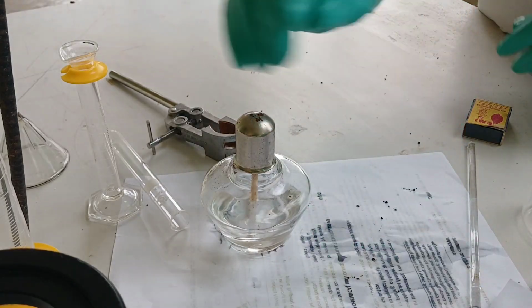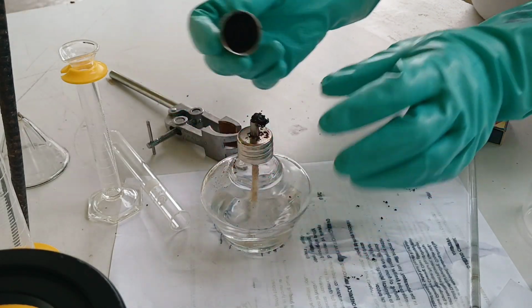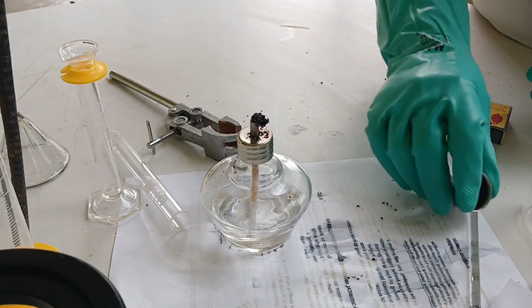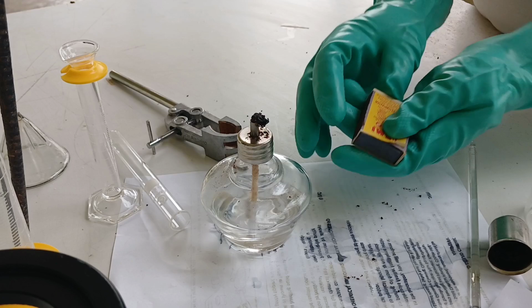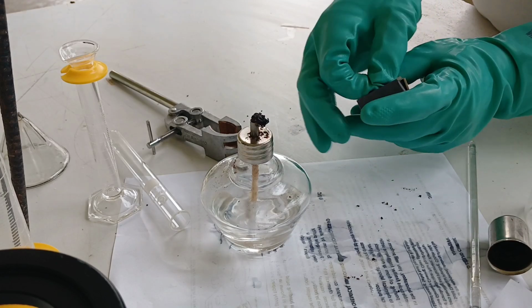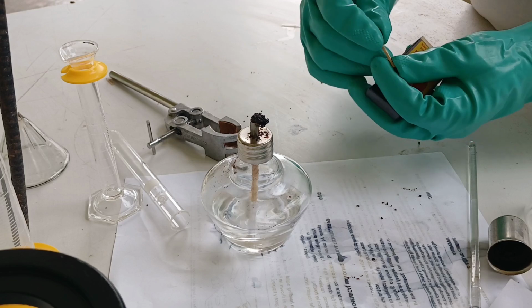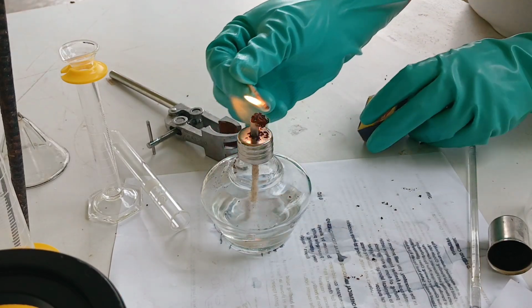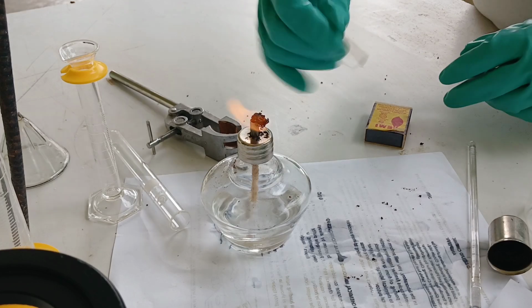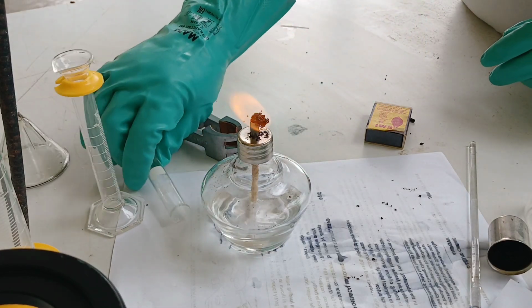By this time, yes, you are correct. You will be using that alcohol lamp again because we will be doing what particular technique? Yes, the safe heating technique for liquid in a test tube. So we're trying to heat liquids in a test tube. Of course, the first thing that we have to do is to ignite the alcohol lamp using a matchstick.